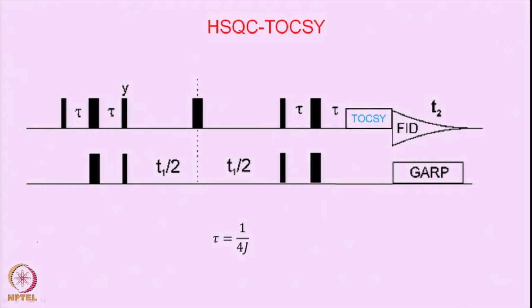So if you have a proton spin system of AMX, each one of them is of course attached to a carbon. Now in the TOCSY you remember that we had the transfer of coherence from here to here and then from here to here. So this resulted in a cross peak between these two. So that is the relay. The relay that happens is now used to correlate the X nucleus chemical shifts to the whole set of protons which are attached in the coupling network.